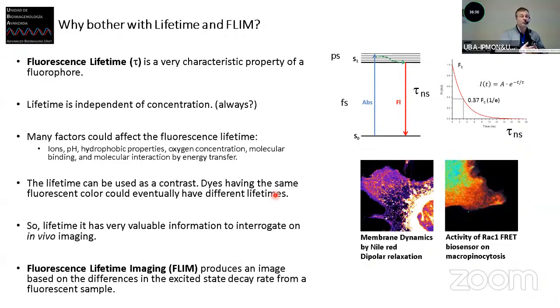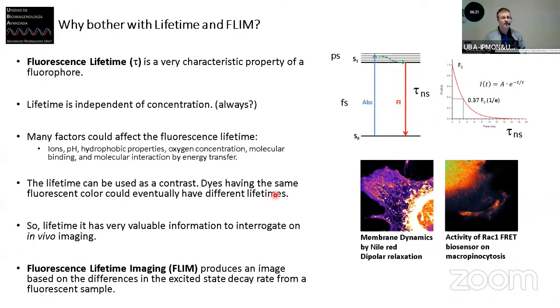You can have two or three similar fluorescent molecules, like green molecules, there are many versions, red fluorescent protein, there are many versions, but they can always have different lifetimes. This is a way to expand your palette of fluorescent molecules to do research. So lifetime is really a powerful tool to interrogate in vivo imaging.